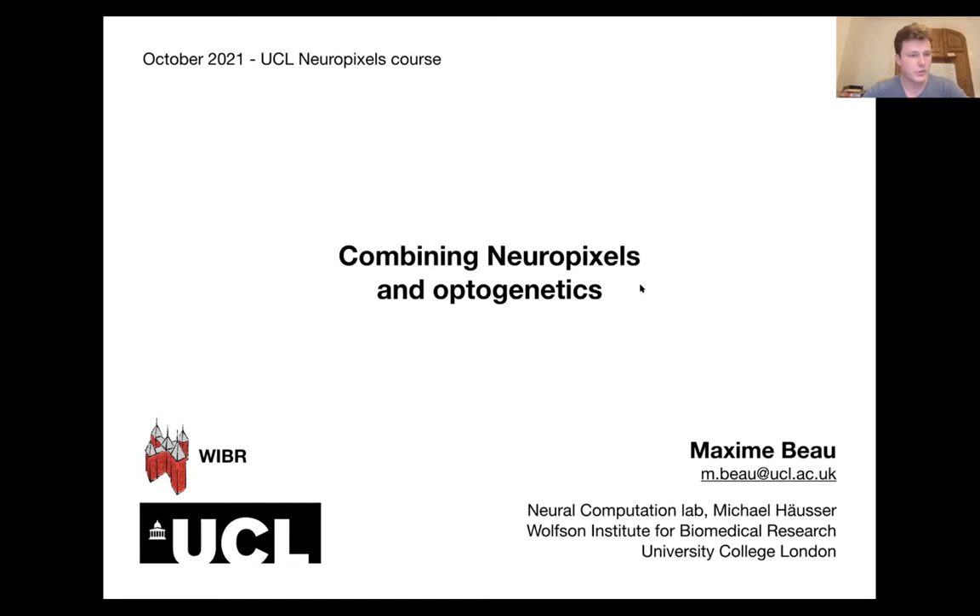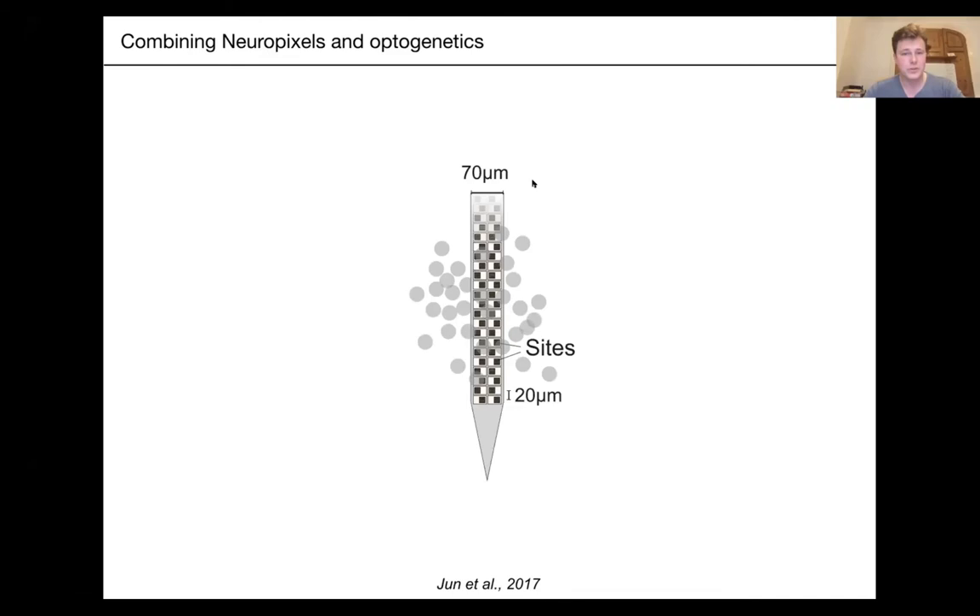Here's our setting. You have your brand new Neuropixels probe. You've successfully targeted the brain region you're interested in — probably the cerebellum — and you have a bunch of neurons around the vicinity of your shank from which you record. You fire up SpikeGLX or OpenEphys and this is what you get.